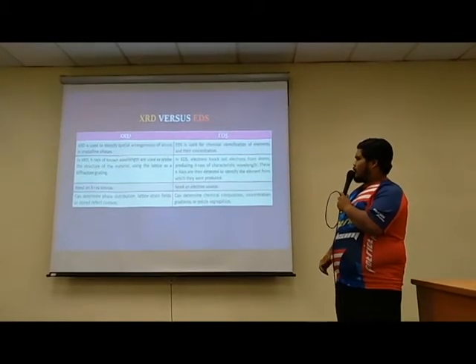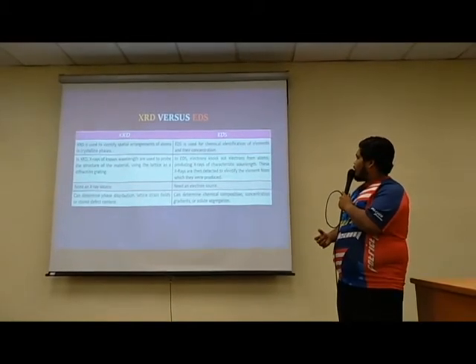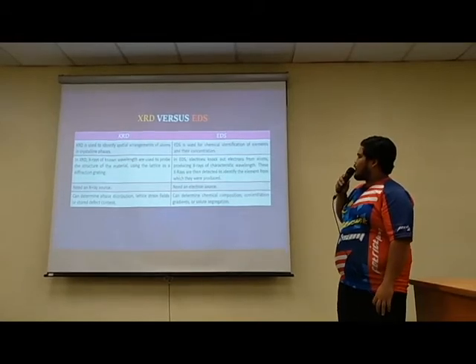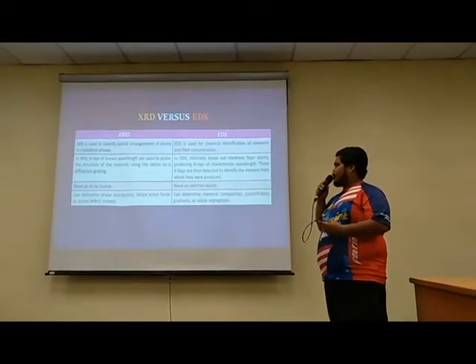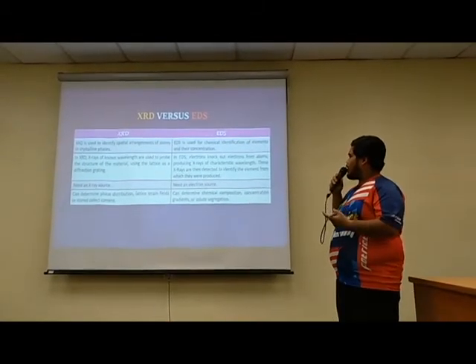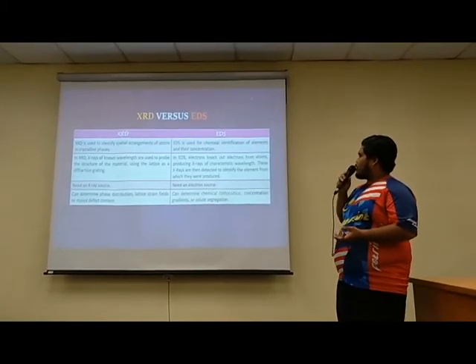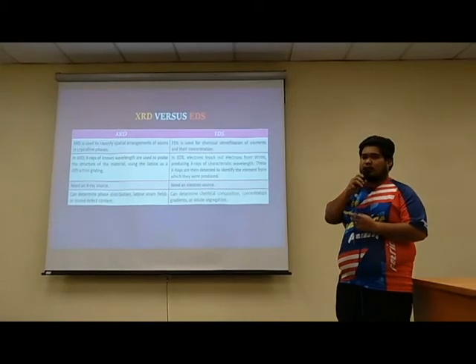For XRD, you need an X-ray source, while EDS needs an electron source. Then we can interpret the phase composition, the strain, or the texture content using XRD, while for EDS we can interpret the chemical composition and concentration gradient.